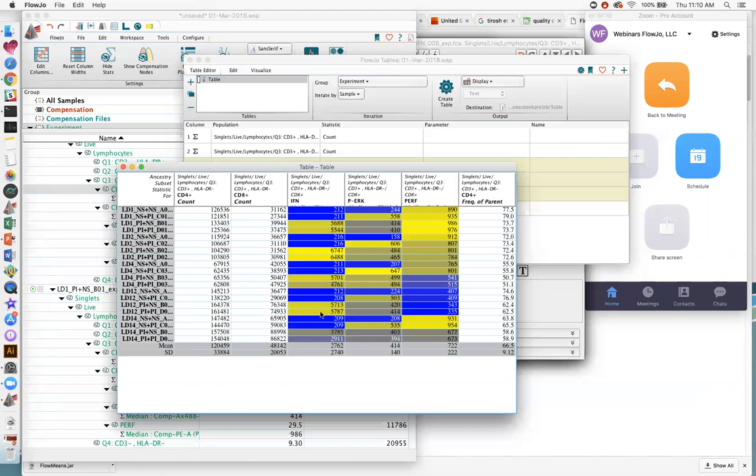And you can immediately see basically what we saw in the graphical reports. The first two stim conditions, non-stim and 20 minutes, nothing is going on. The warmer colors here indicate that something is happening. At 1 hour and 2 hours, we definitely have some activation. With phospho-ERK, you have non-stim, nothing going on, at 20 minutes something goes up, and then it begins to go down after 1 and 2 hours, which is kind of expected for a MAP kinase with a phosphorylated signature.